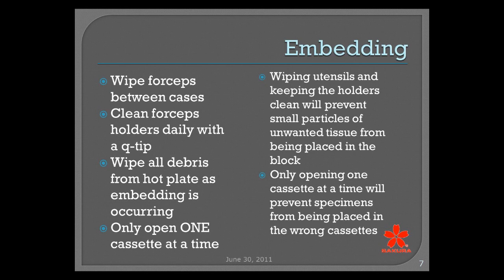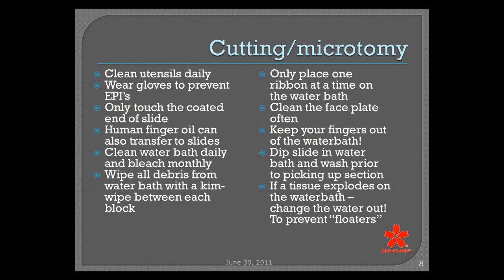So by wiping our utensils and keeping the holders clean, we'll prevent small particles of unwanted tissue from being placed into another block, and only opening one cassette at a time will prevent specimens from being placed in the wrong cassette.